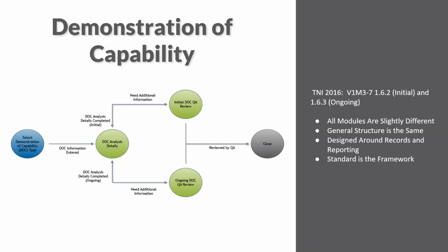All of these modules are different. So if we were to try to build something to accommodate for all of those, it would be just a disaster and you wouldn't even want to use it. So we decided instead, let's focus on what's the same, what's the general structure of everything. And let's design a workflow that's really focused on record keeping and reporting, right?